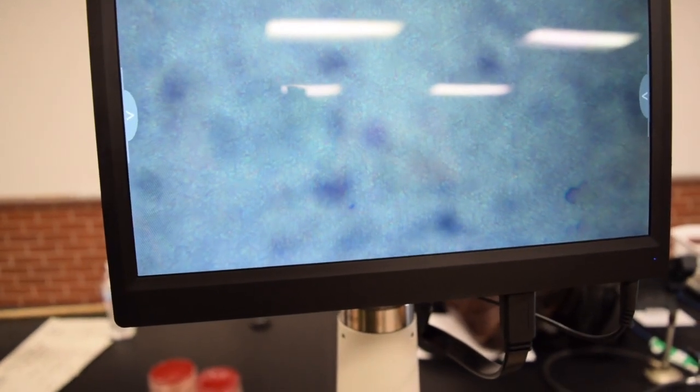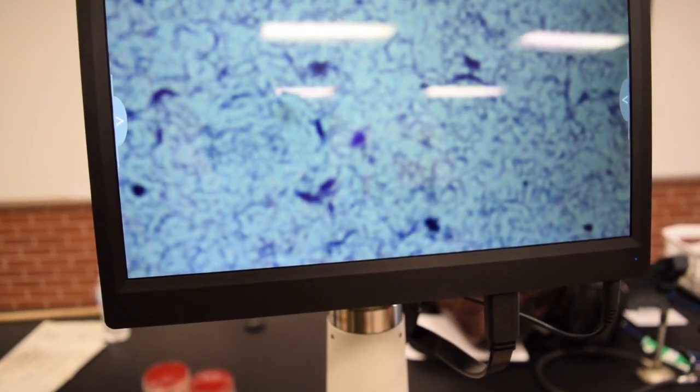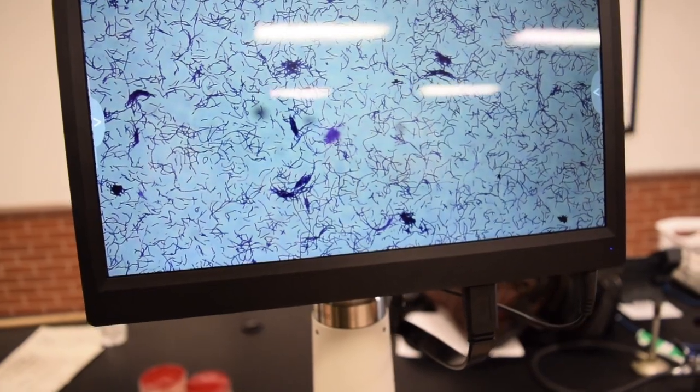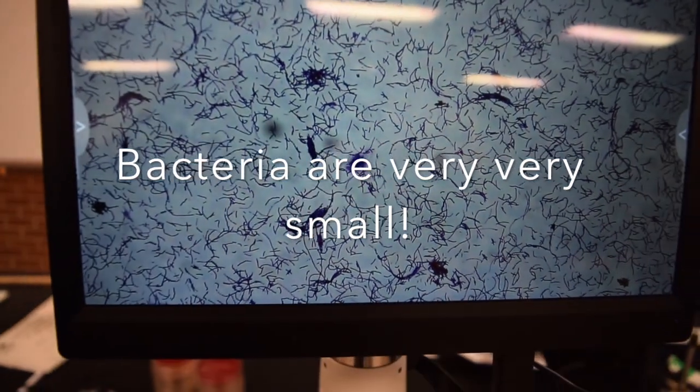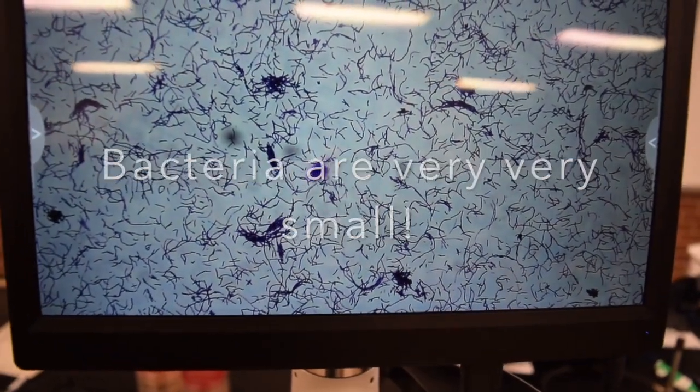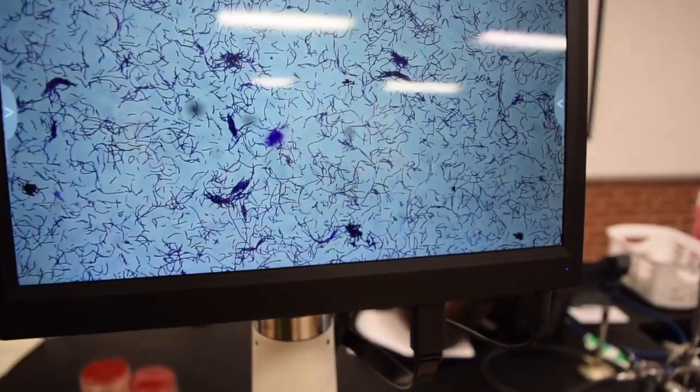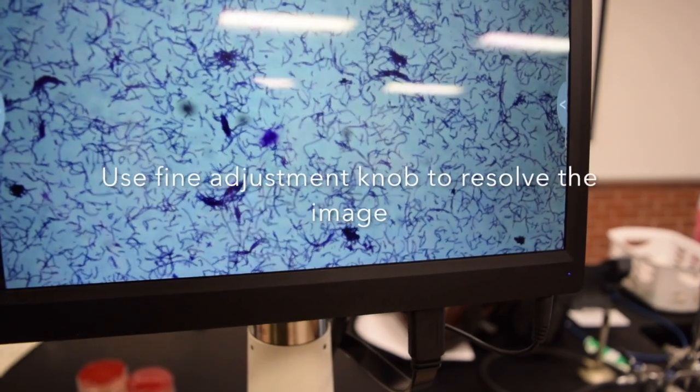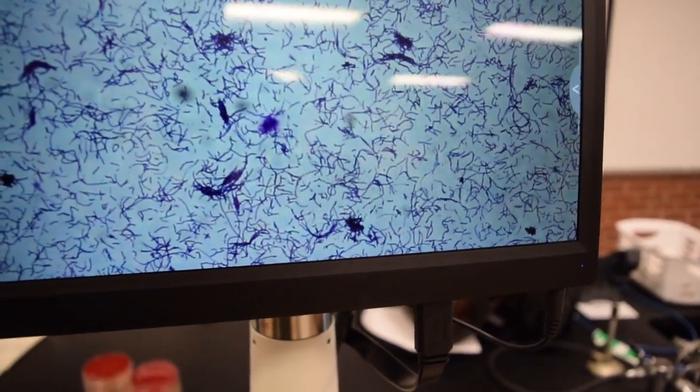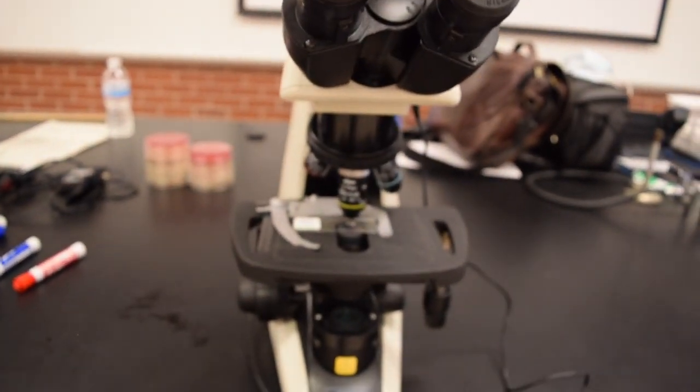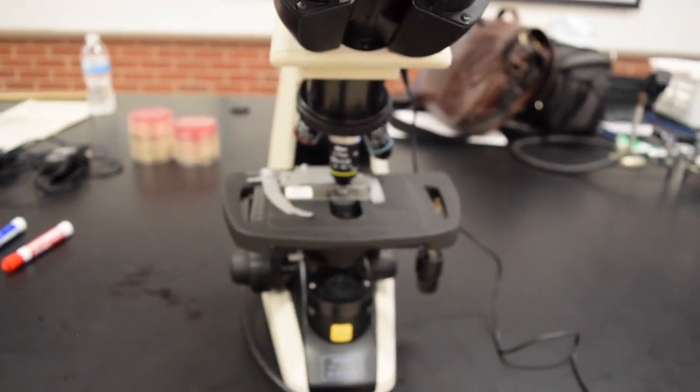Using the coarse adjustment knob, now I have what I'm supposed to be looking at - bacteria at 100 times magnified. I use the coarse knob to find that, and from there I use the fine focus to bring it into better clarity. This scope has parafocal capability, meaning that all I have to do to switch objectives is move the objective.